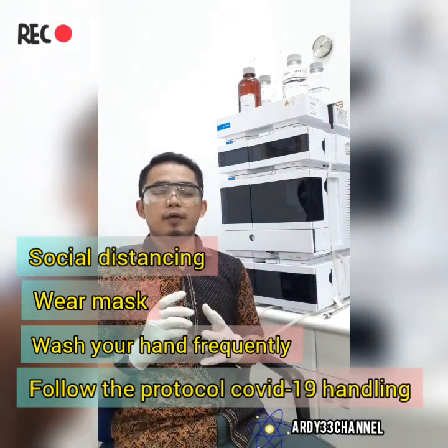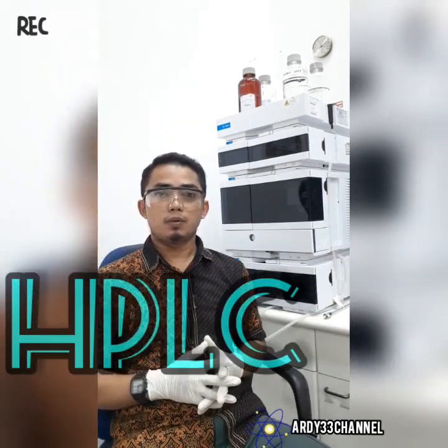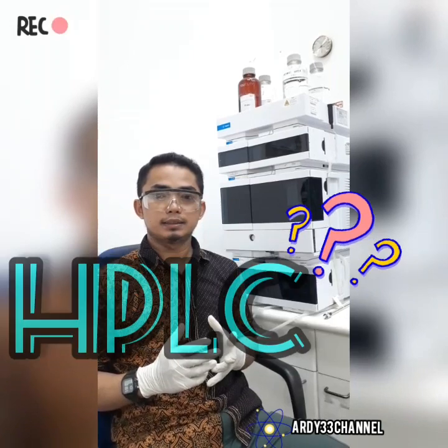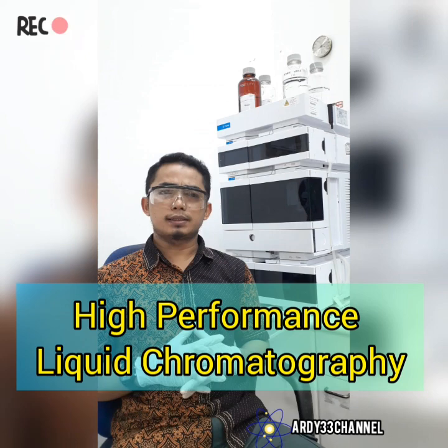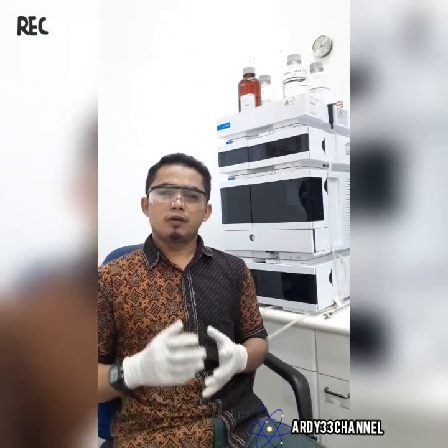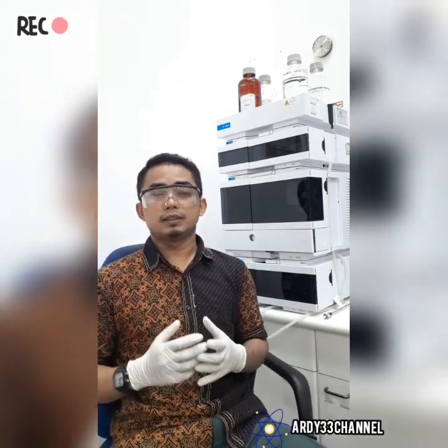On this occasion, I will discuss a little knowledge about HPLC. What is HPLC? High Performance Liquid Chromatography, or high pressure liquid chromatography. For people who are studying or working in the field of natural science, including analytical chemistry, pharmacy, food chemistry, and medical science, this is no stranger, especially the word chromatography.